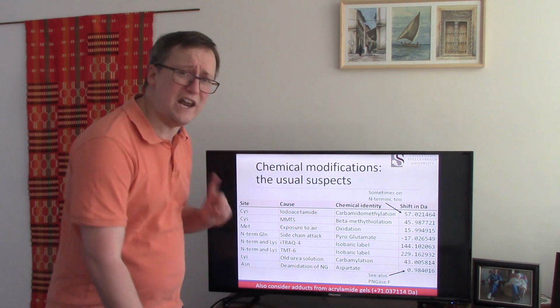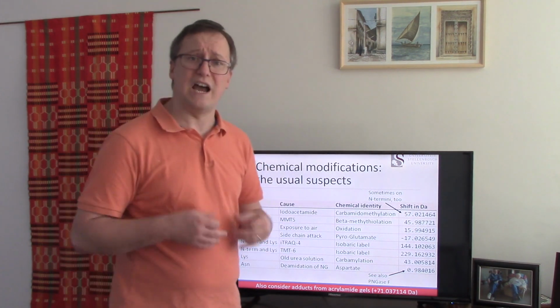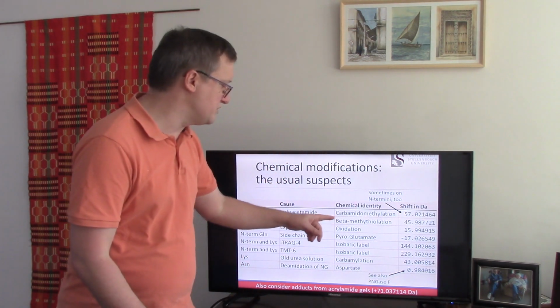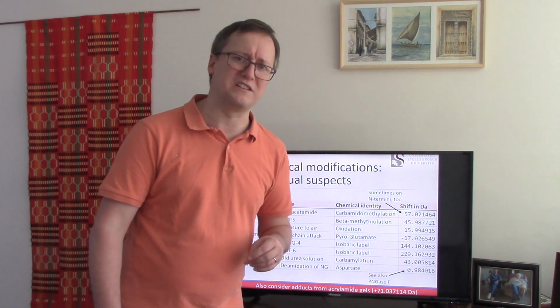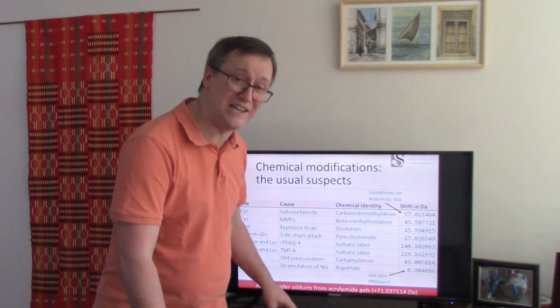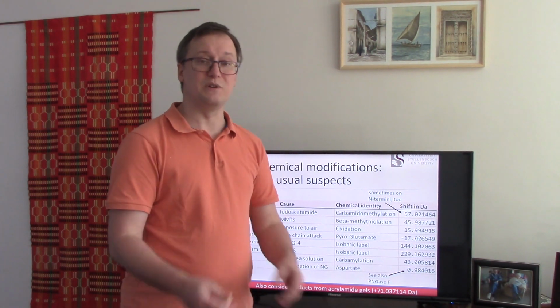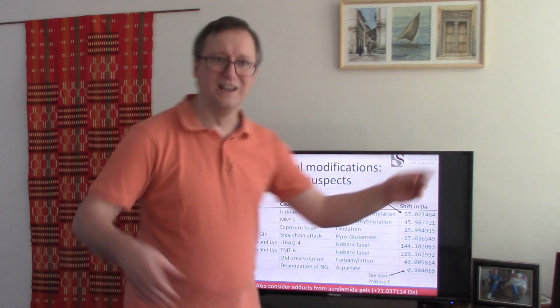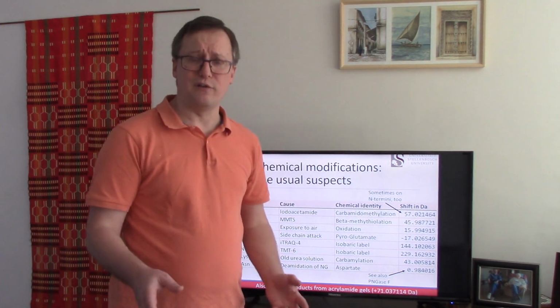That is not, however, the only way that people mess with their cysteines. We frequently find that people who are using iTRAQ reagent to make a quantitative proteomics experiment will, instead of using iodoacetamide, use something called MMTS, and I'm not qualified to pronounce what that stands for. That creates a modification called beta-methylthiolation, which has a mass shift of very close to 46 Daltons. So instead of having a mass of 103, it's going to have a mass of, doing my math very quickly in my head, 149. Okay. So cysteine gets handled a variety of different ways.